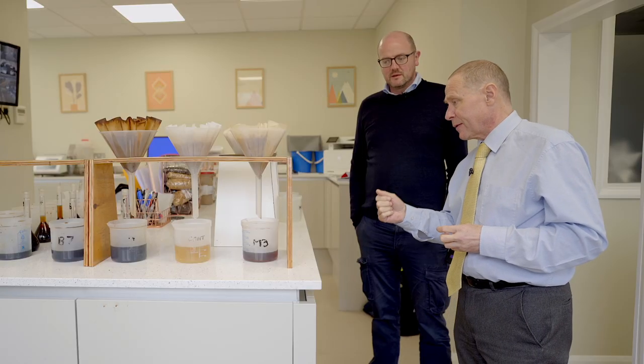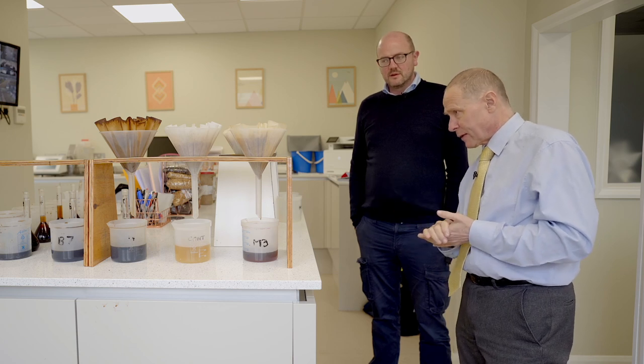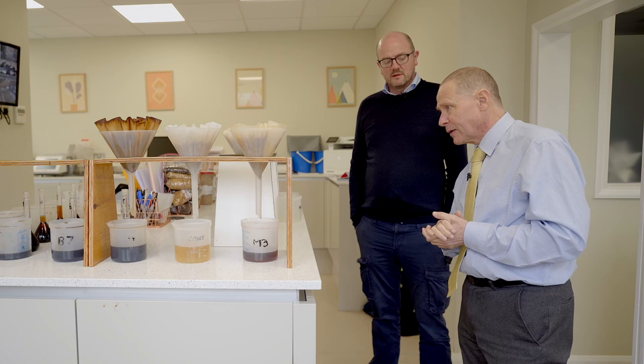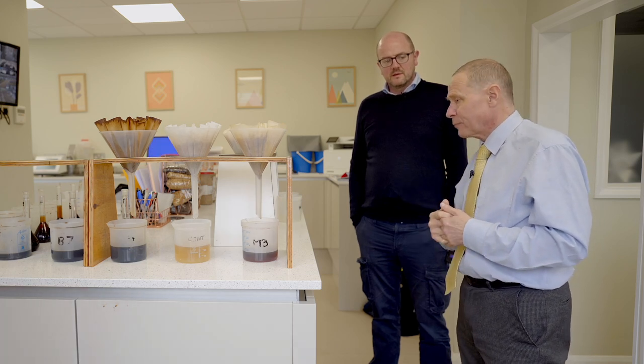Take us through the process here. The malt has been made and crushed to the required level, then analysed using one of the methods, and then it's filtered so we get the wort off it. This is what we test for colour and extract. The volumetrics — we have to dilute it down so it gets onto a specific ring on the Lovibond meter if you're testing it that way. Some of them can just be read without doing that, which is better because you're not introducing factors of error by diluting. But you can't do that with the much darker ones.